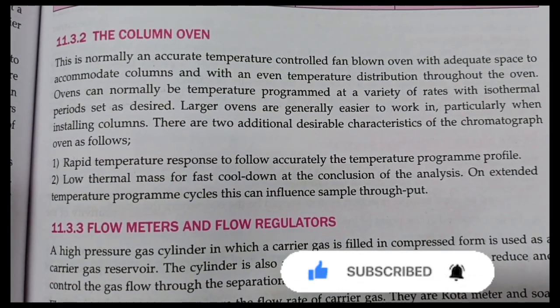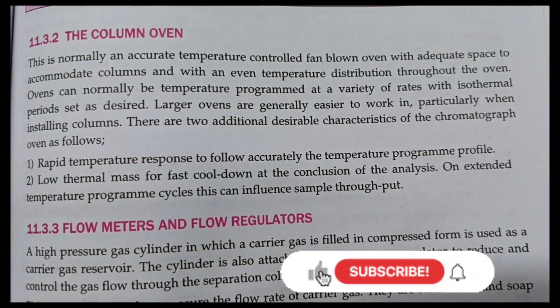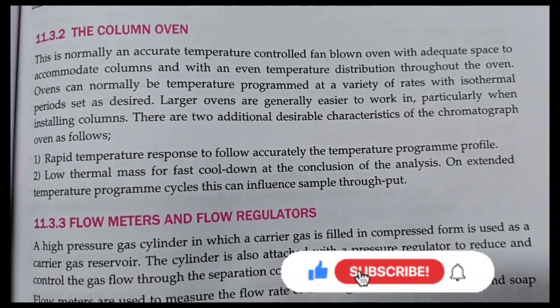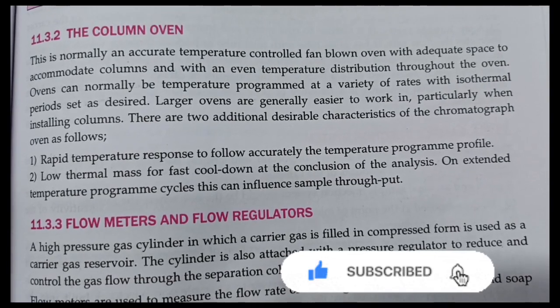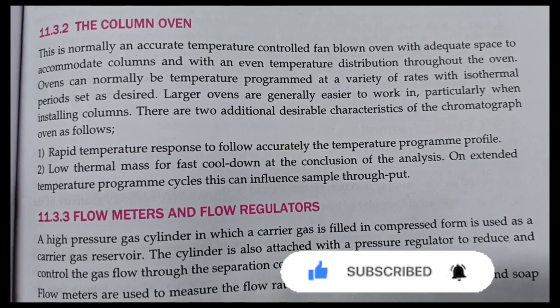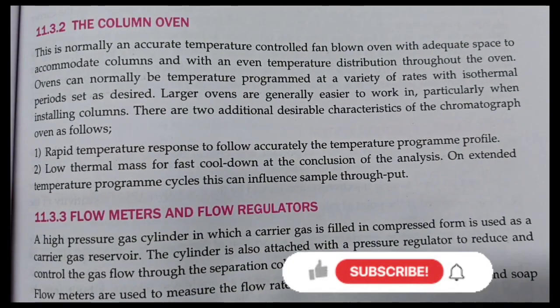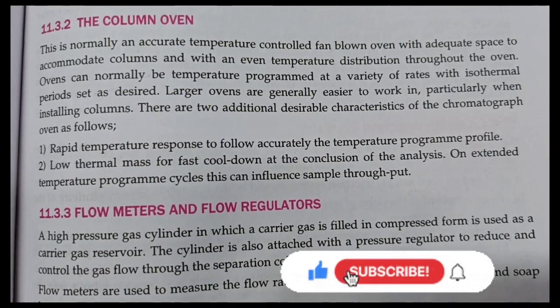The column oven. This is normally an accurate temperature-controlled fan-blown oven with adequate space to accommodate the column and with an even temperature distribution throughout the oven. Ovens can normally be temperature programmed at a variety of rates with isothermal periods set as desired.